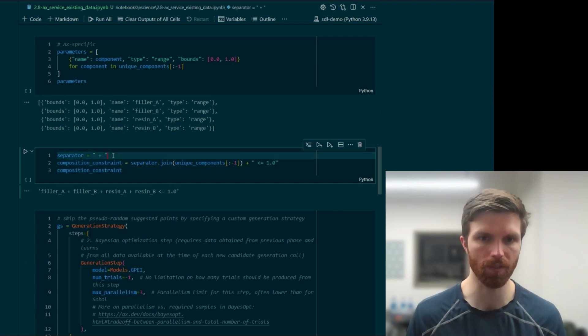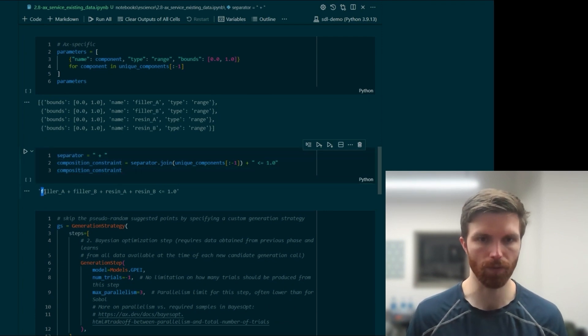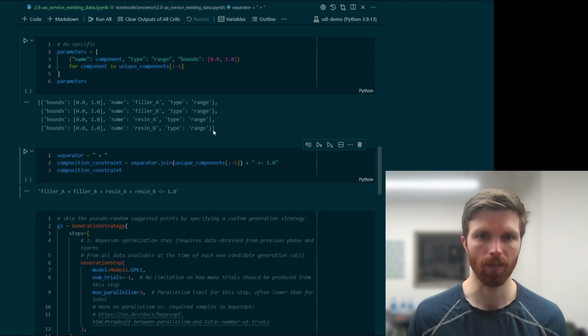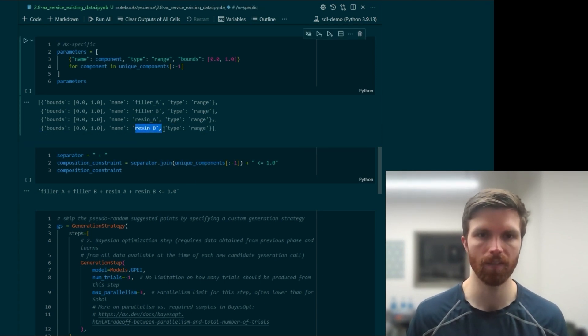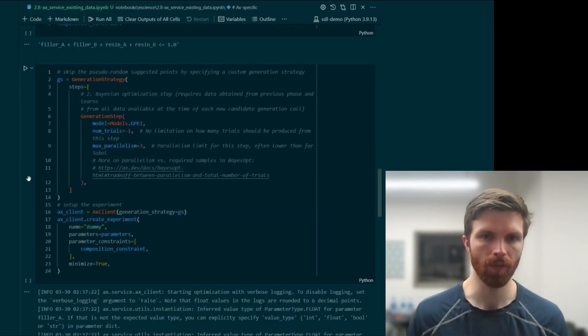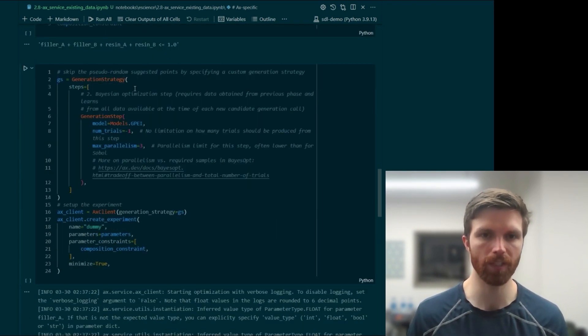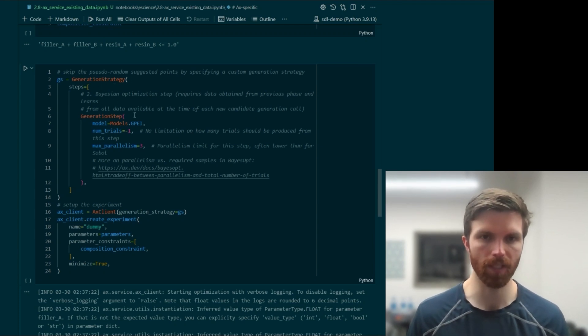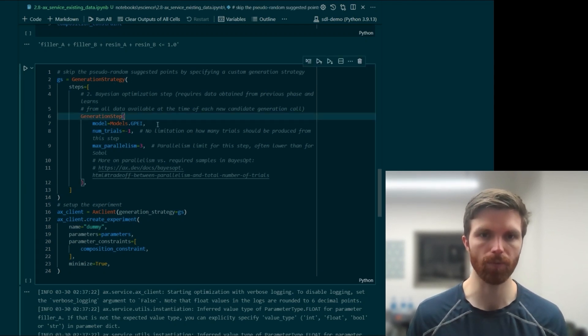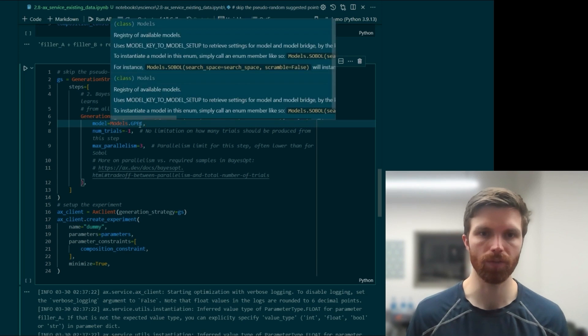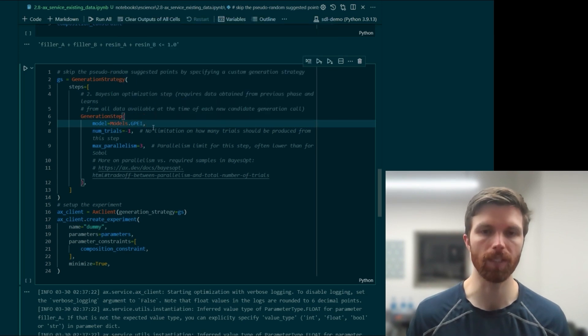We've got our composition constraint. Like I mentioned, the first four parameters will be set to be less than or equal to 1. And notice here that we dropped out resin C from the search space. We'll create our generation strategy, which skips the Sobol sampling step, the quasi-random generation, and go straight to using the GPEI model.